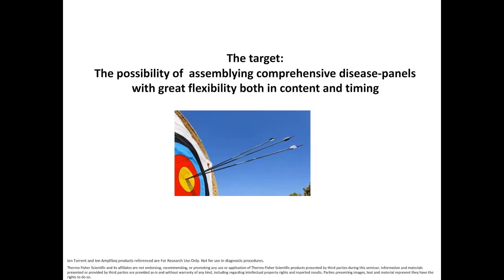The next generation sequencing of the Ion Torrent is innovative and is more sustainable, in my opinion, than others.